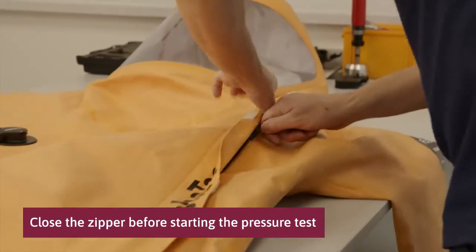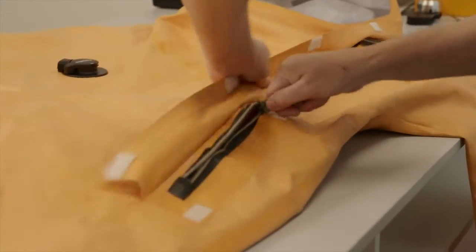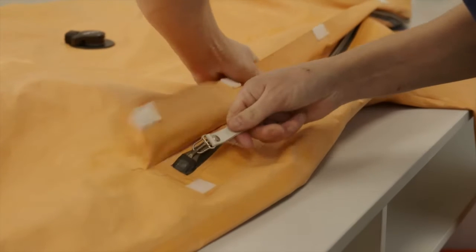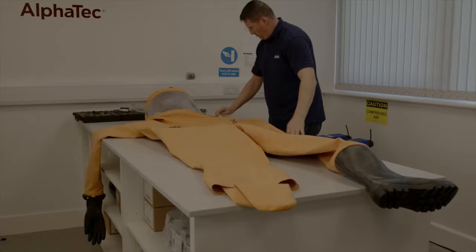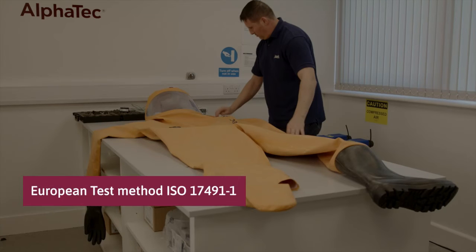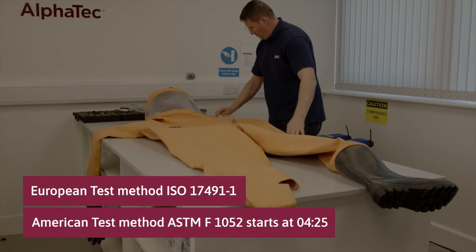Close the zipper before starting the pressure test. There are two different methods for pressure testing a gastight suit: the European test method ISO 17491 Part 1, and the American test method ASTM F1052. This instruction video starts showing the European test procedure, with the American test procedure to follow.